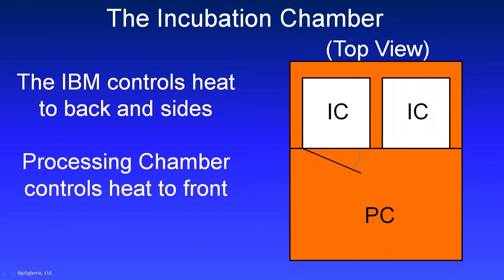So it's important to have things like the door closed on the back of the IBM. We've had customers that have left the doors open for quick access to sensor pods that are located in the back, and then wondered why their incubator chambers were working so hard to keep their temperature up. And that was because it was trying to heat the whole room.